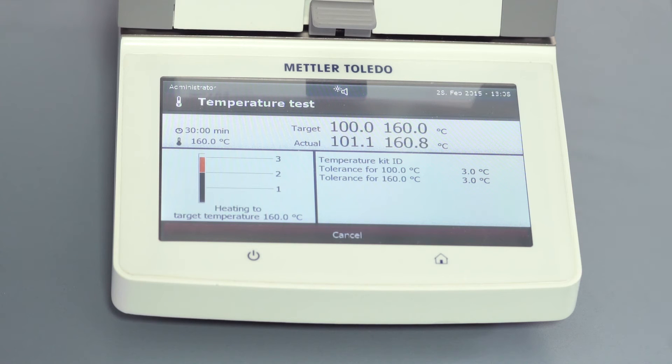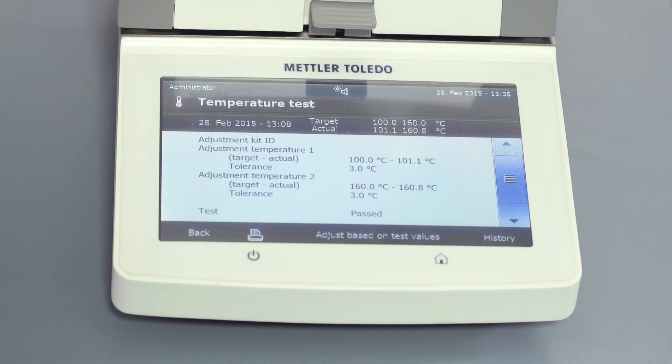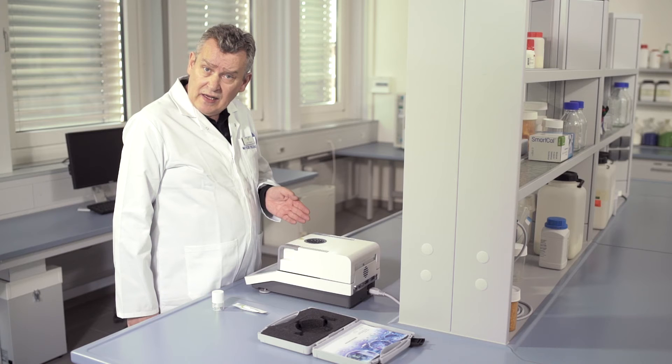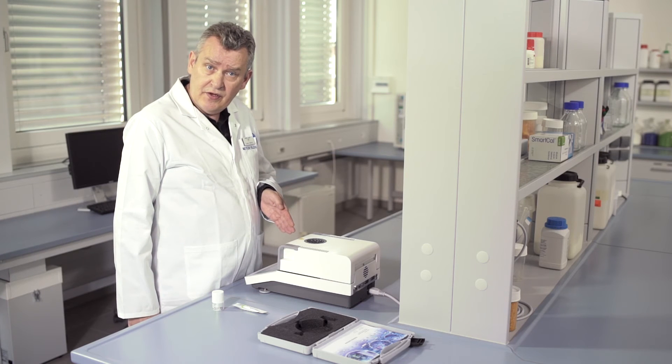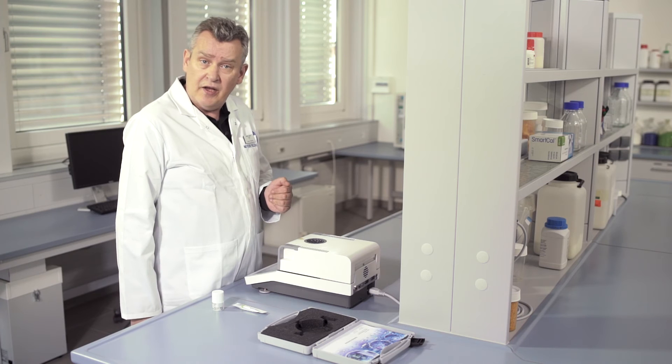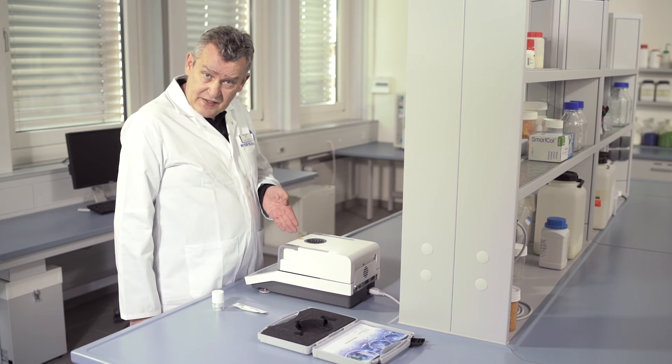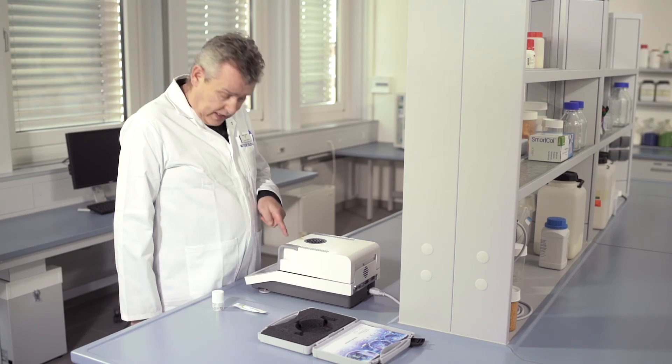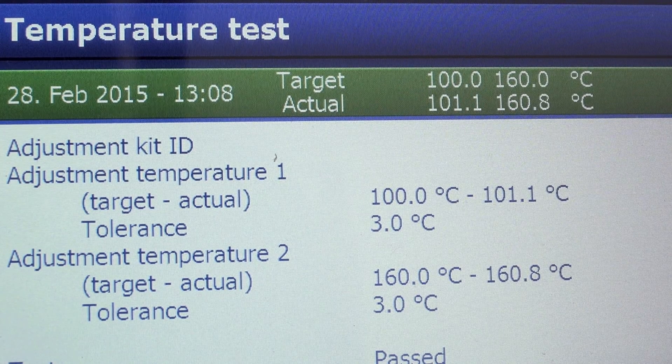If there are noticeable deviations, you may want to use these results directly to perform an adjustment, which will save you significant time. In this case, the test is successfully finished as you can see from the green bar.